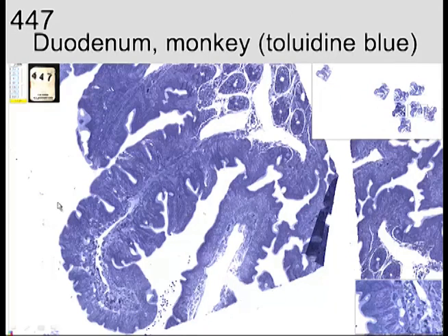Another type of stain that was H&E preparation that we're seeing. This is Toluidine blue. Remember, with Toluidine blue, everything is blue. You have to look at the size of things, the shape of things, and the intensity of staining. Here's a lymphatic through the center. This is a central lacteal. These are the intestinal absorptive cells in through there. These are their nuclei, and there is the brush border.